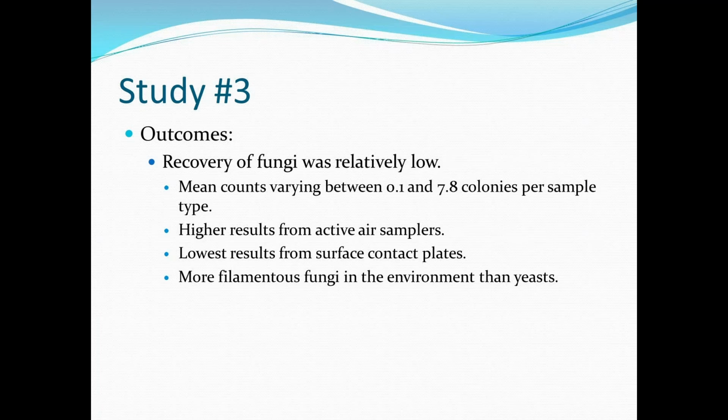So the outcome of this study was that recovery of fungi was relatively low, and the mean counts ranged from less than 1 to about 8 colonies per sample type. Interestingly, air samplers tended to record more fungi than surface samples.